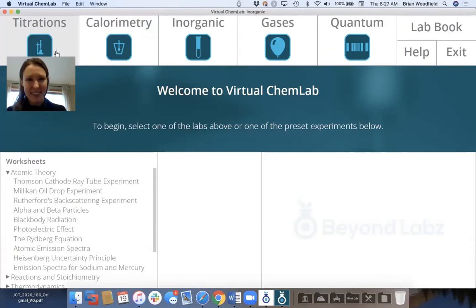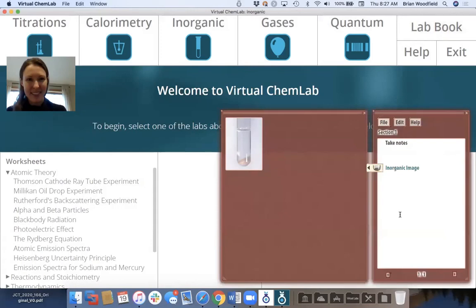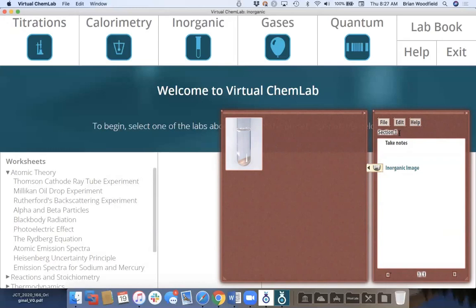If it helps, Brian, I created a lab notebook. High school labs often spend so much time teaching students how to write out all the procedures. If you open your lab book there, you can have students write pages and pages of their procedures and all of the things they're observing, and then they can just send it to you, and you can do your lab notebook replacement within this, where they're analyzing all of the data, whether they find it in the bio lab or the physics lab. Any of it can be saved in this notebook and then shared. So all the results, like all those detectors that I showed inside of the quantum lab, can all be saved.